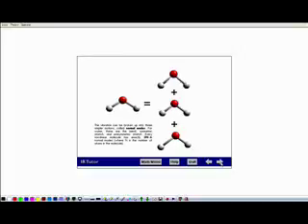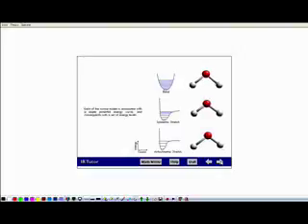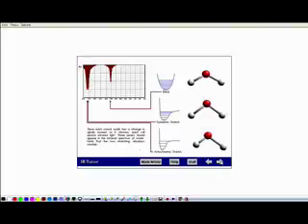If we looked at each one of those motions, they show up at different positions on our infrared spectrum. The 2 stretches, the symmetric and asymmetric stretch, show up at about 3,400, 3,500 wave numbers, and the bending motion shows up at about, I think, 1,600 or 1,400. So this motion is what we're going to be measuring. And so water absorbs infrared radiation.